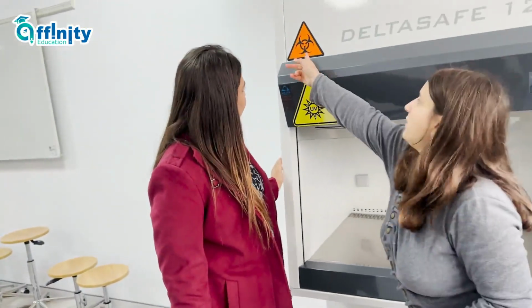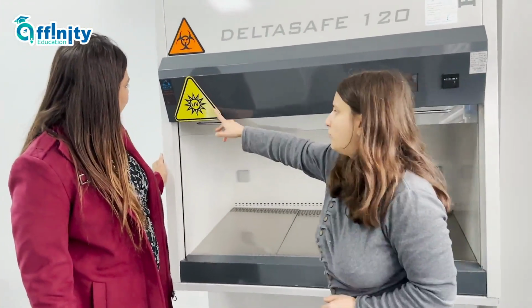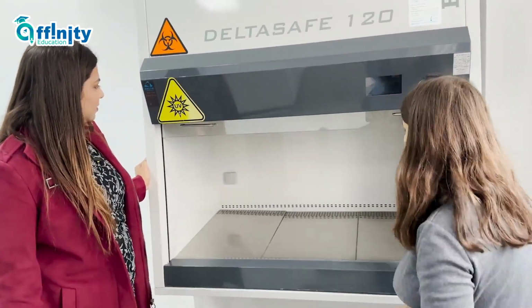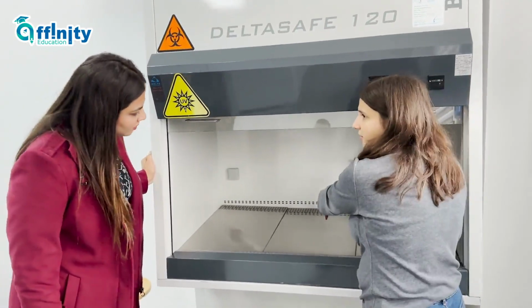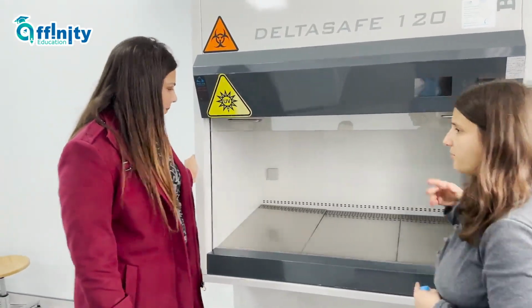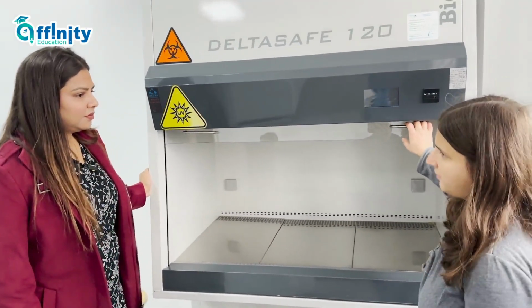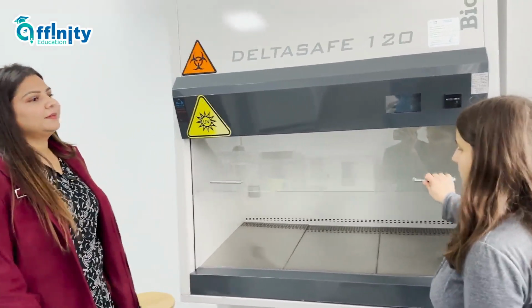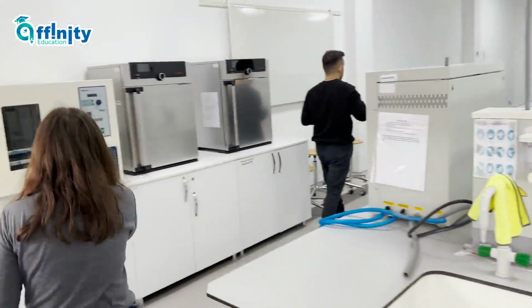As you see, this one is for very dangerous microbes, with ultraviolet UV. As I showed you there, which I did, they are doing it here because sterilization is happening all the time here for dangerous microbes. That's it. This one also is an incubator.